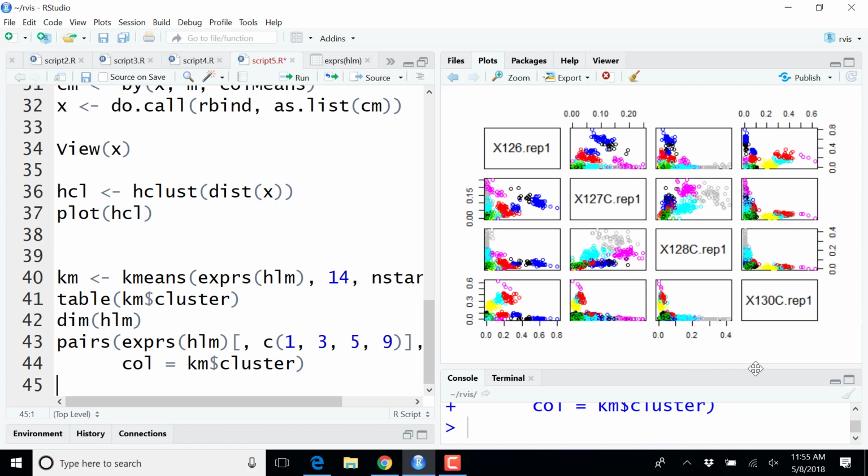Okay. So if we look at this and that dimension, we have cluster here, cluster here, cluster here. If we look along these 2 dimensions, we see that we have other clusters that are resolved. But this is 10-dimensional data. How are we going to assess how good our clusters are? We'll see that we can use principal component analysis to simplify this data set along 2 dimensions to visualize them.